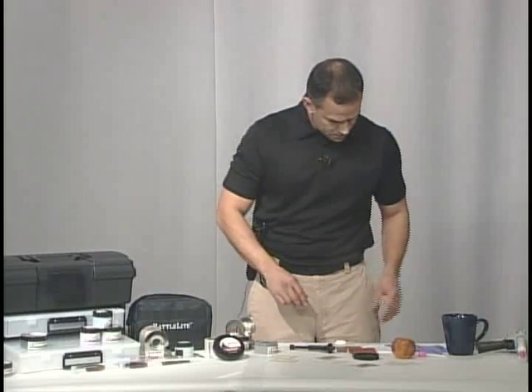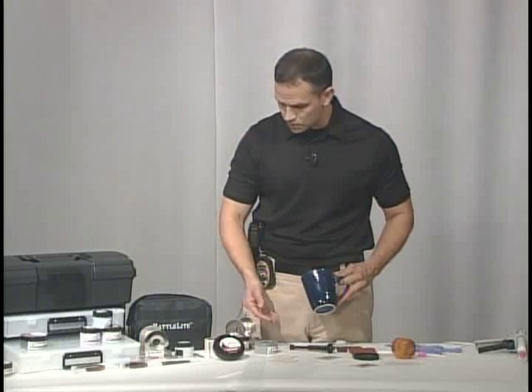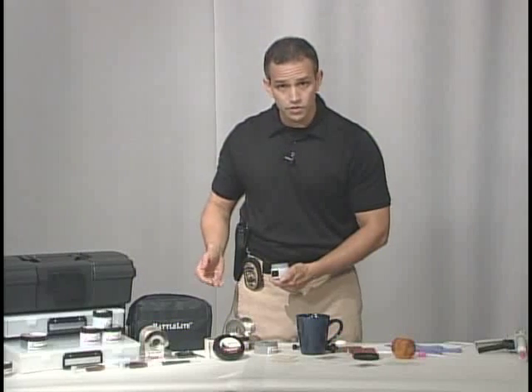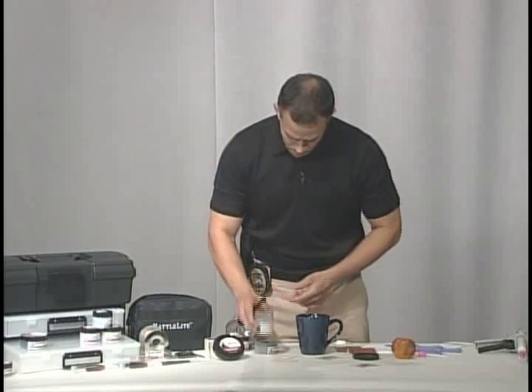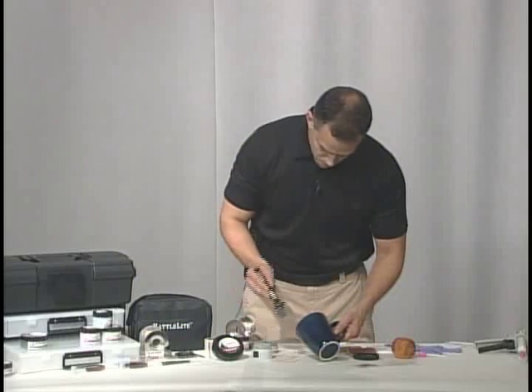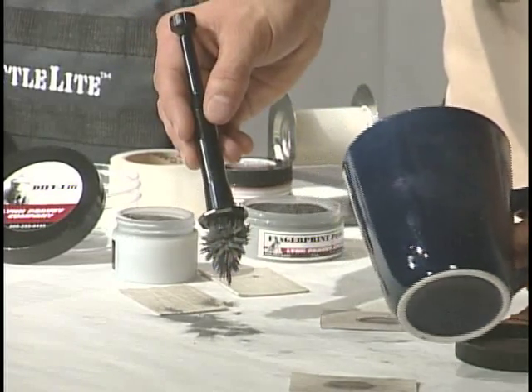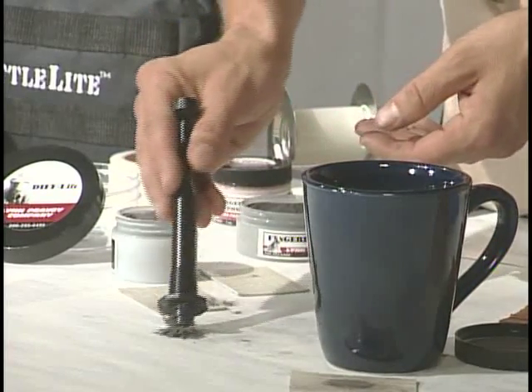We also have the mug. The mug here is dark colored, so we're not going to want to use our black powder. So we're going to use a gray powder. Magnetic powder comes in all different colors — it comes in the fluorescent, so you would need your alternative light source to view it. But we're just going to use a gray powder to develop our prints on our dark mug. Lightly brush. Now we see that our print is developed. Do our cleanup, and we have our print.